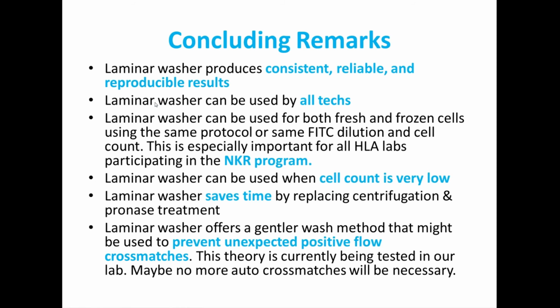Laminar washer offers a gentler wash method that might be used to prevent unexpected positive flow crossmatches. This theory is currently being tested in our lab. Maybe no more auto crossmatches will be necessary.